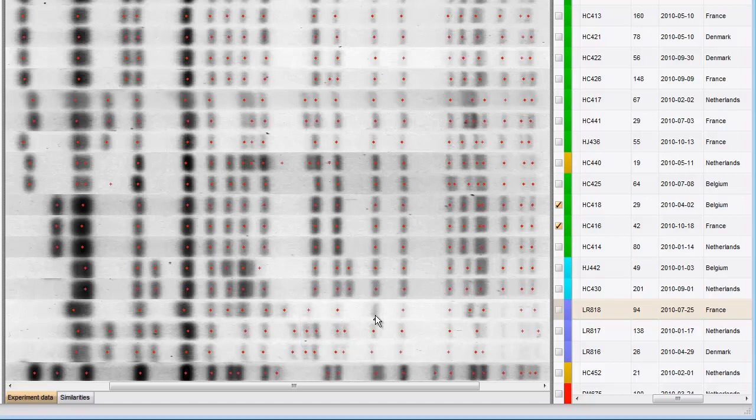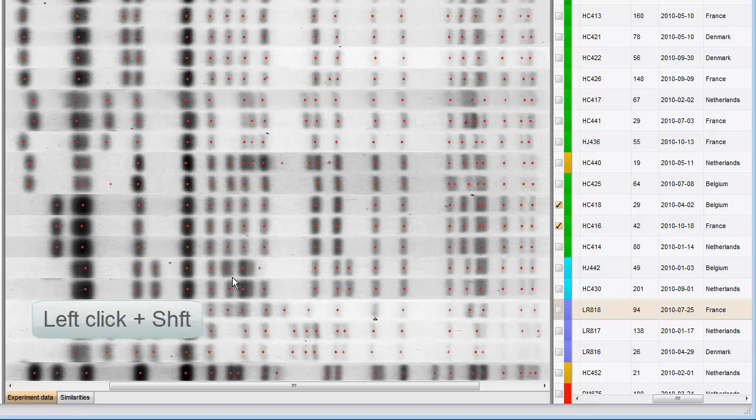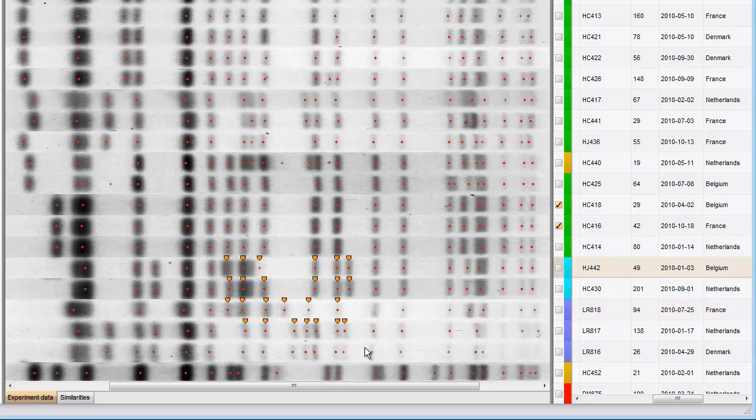I can even select a group of bands by holding down the Shift key while dragging the mouse. For example, to remove them.